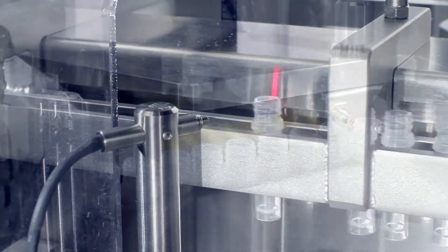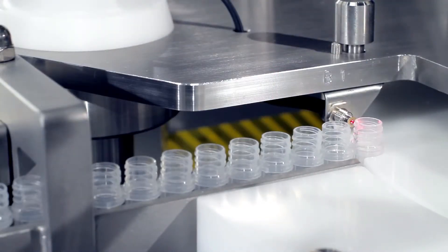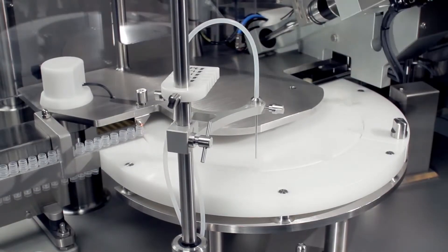Microtubes are fed into a filling station from a customized vibrator bowl and chute. A peristaltic filler ensures accurate filling and prevents costly overfills, even on fill volumes less than 0.2 milliliters.